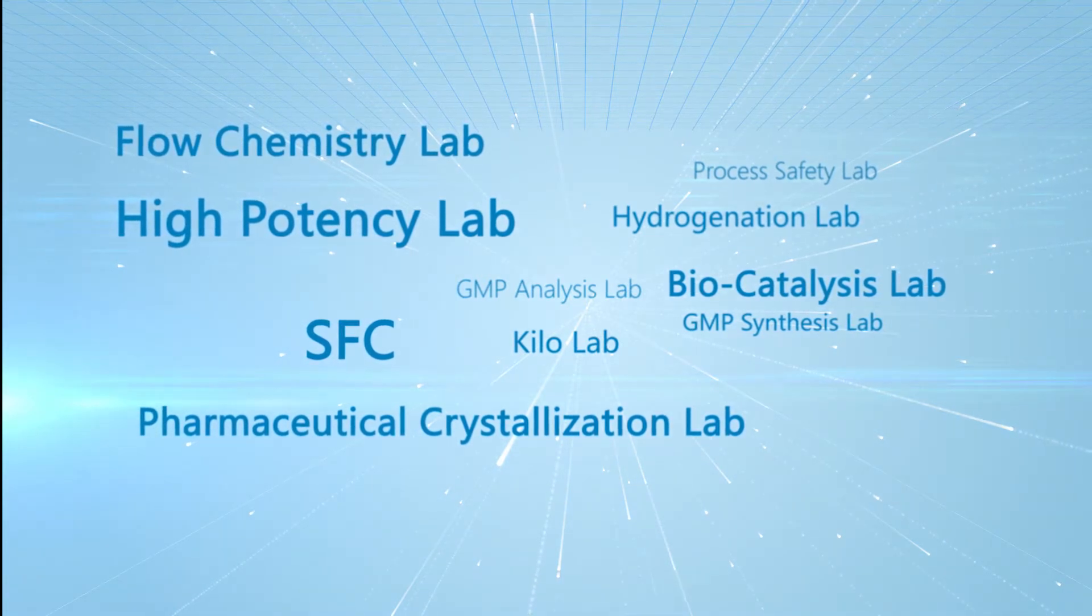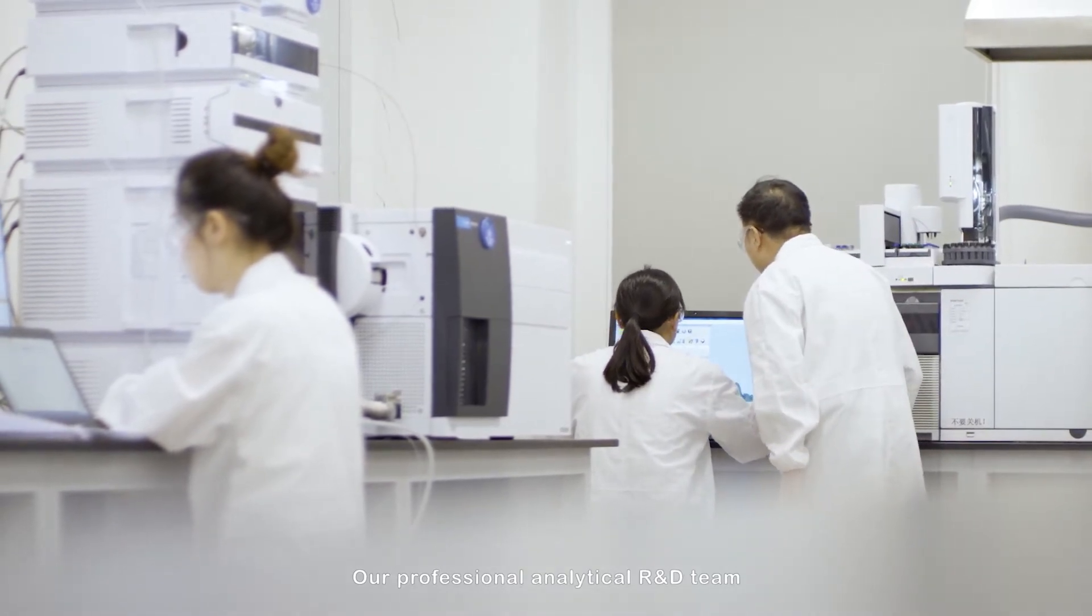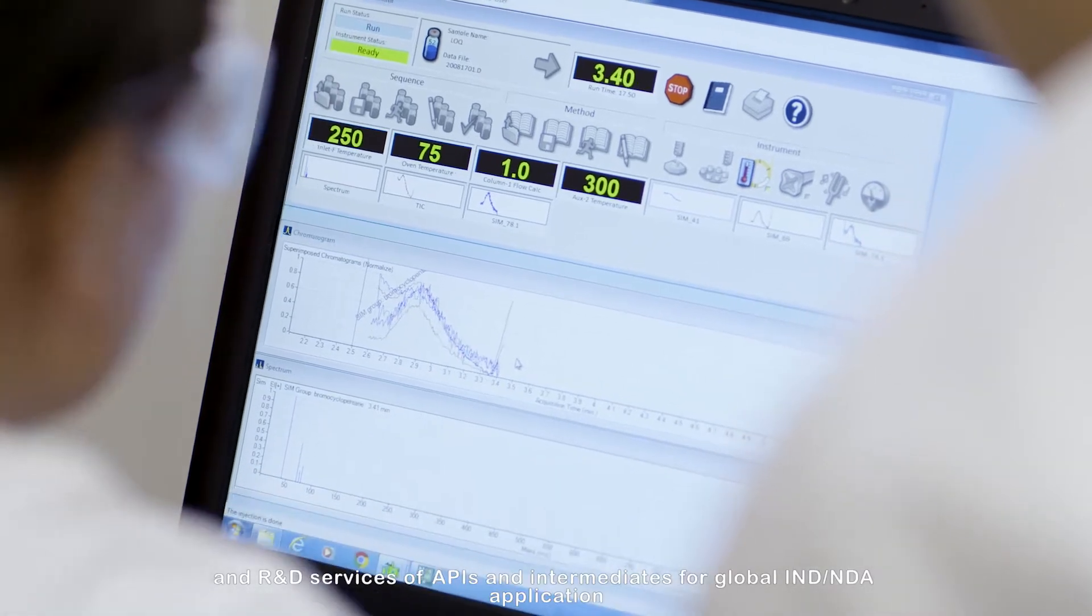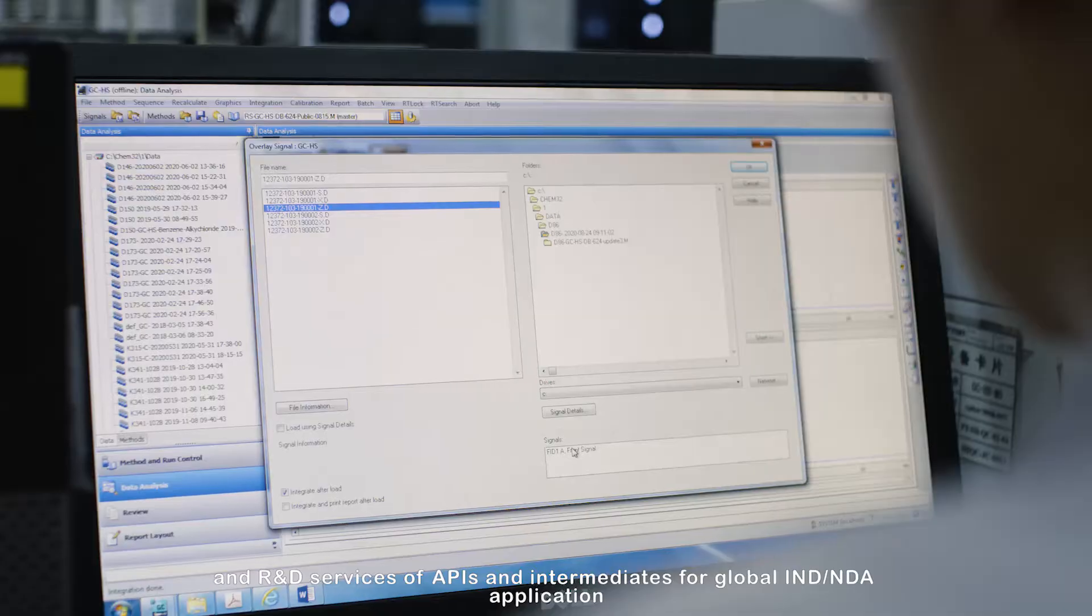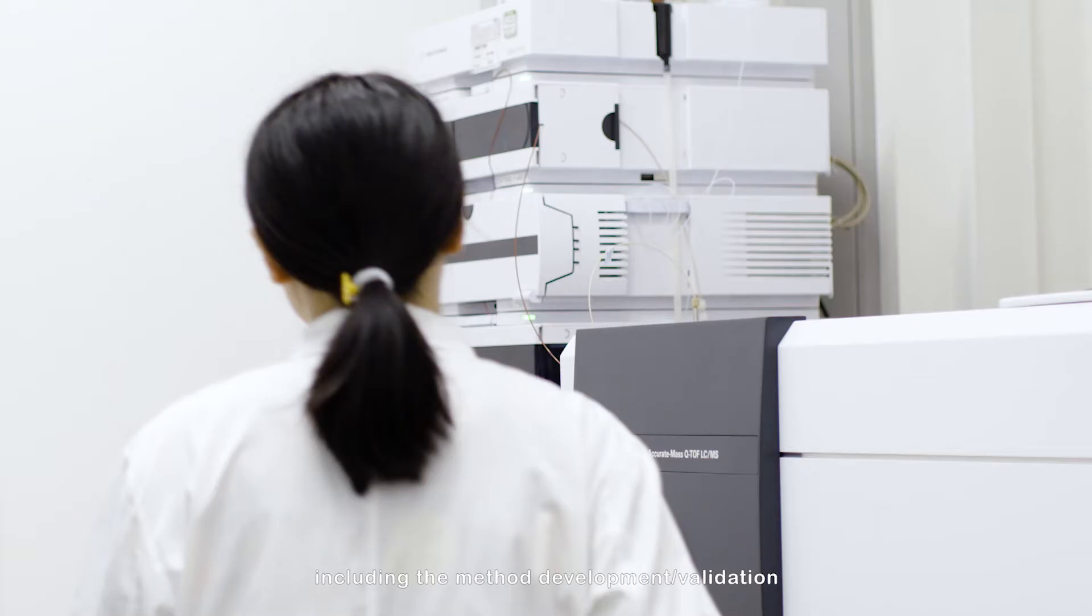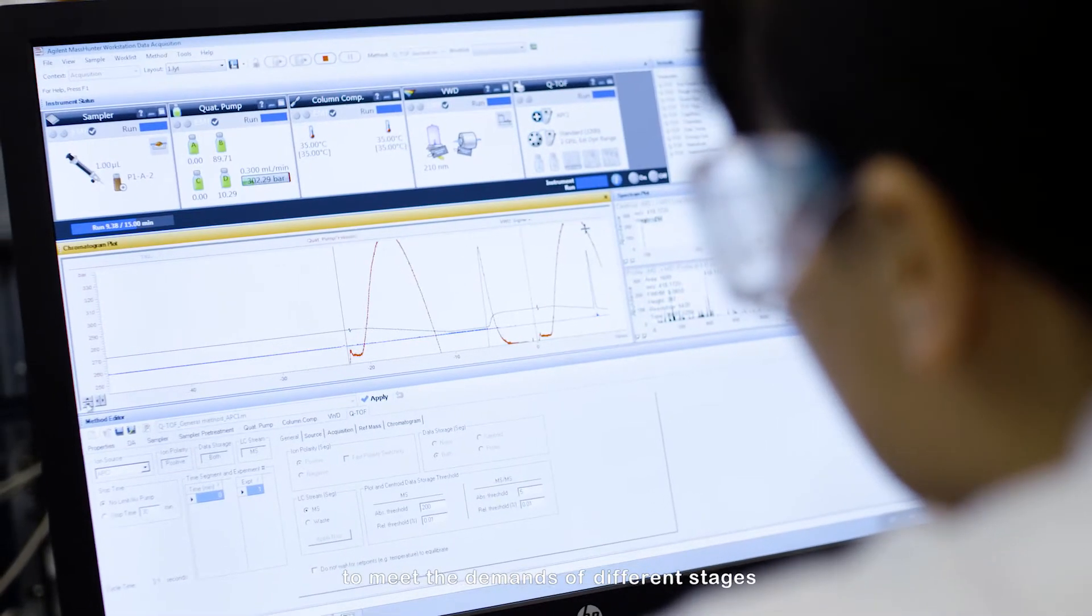Flow Chemistry Lab and SFC Lab. Our professional analytical R&D team is able to provide clients with analytical R&D services of APIs and intermediates for global IND NDA application, including the method development validation, stability study testing, etc. to meet the demands of different stages.